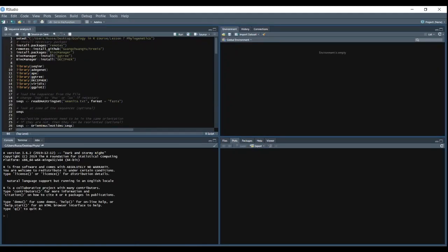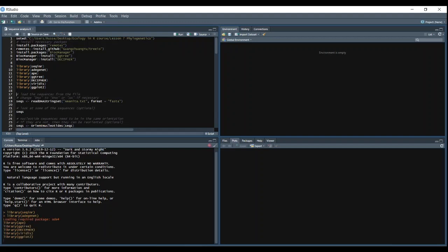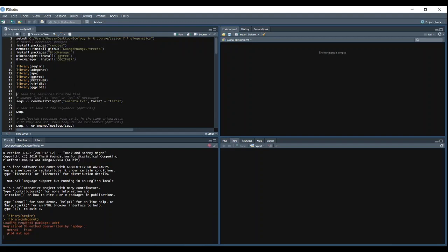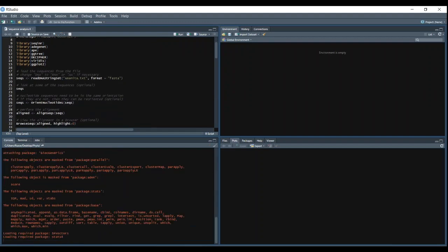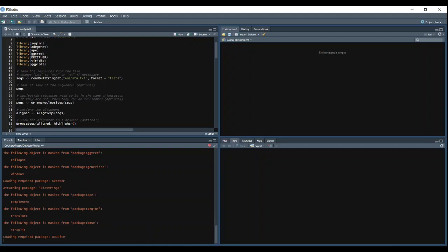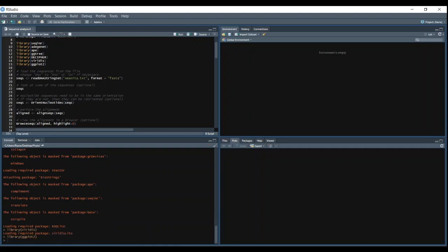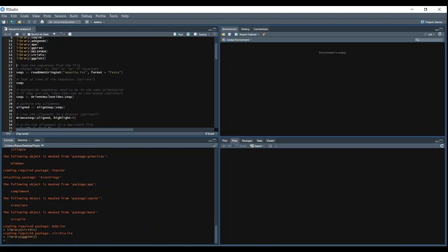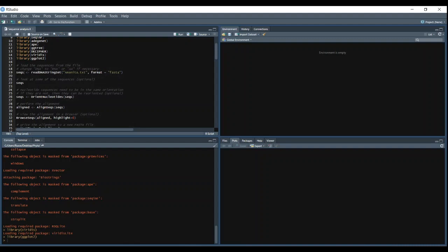The first thing we do is open all of our necessary packages in the library. And then you read in the FASTA file, so we want to use readDNAStringSet. There's a lot of different ways that you can do this, but I found out that this is the best method so far.